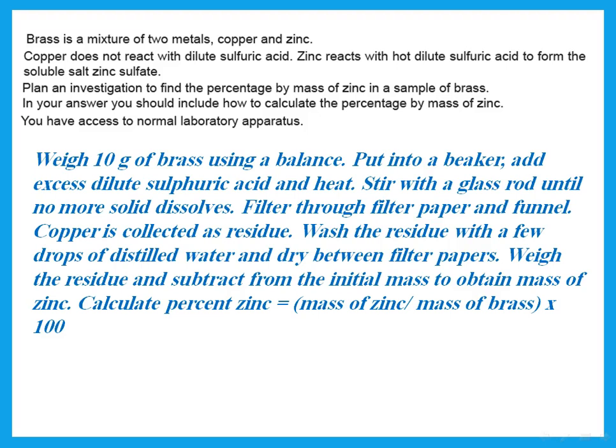I weigh at the beginning. Weigh 10 grams of brass using a balance. Put into a beaker. Add excess acid and heat. Stir with a glass rod until no more solid dissolves. Filter through filter paper and funnel.